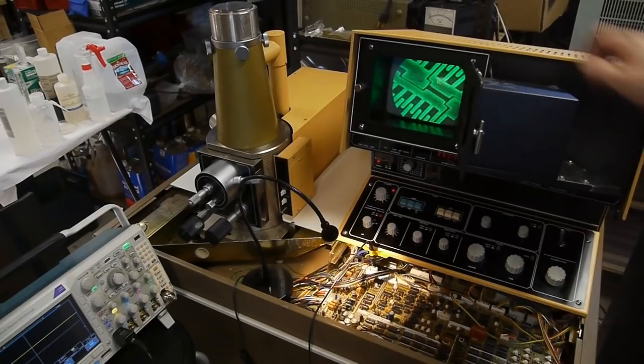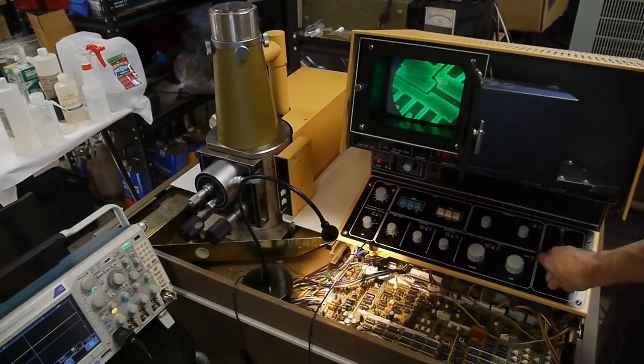So currently we're looking at a MEMS gyroscope, and as you can see we're live here, we can zoom in and out and pan around like this.